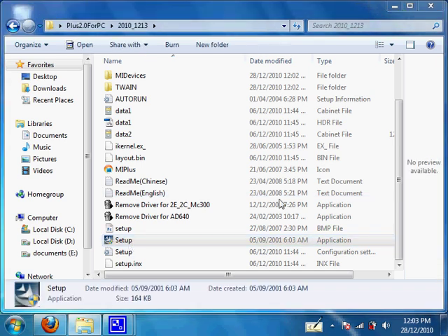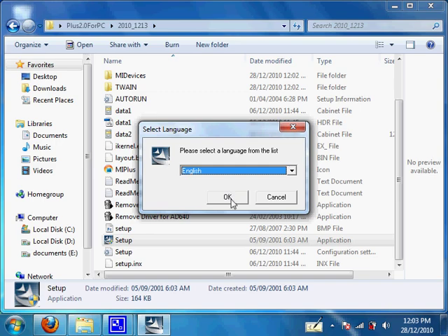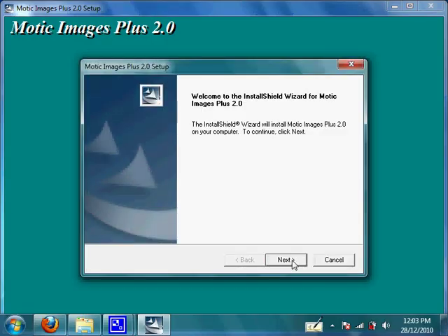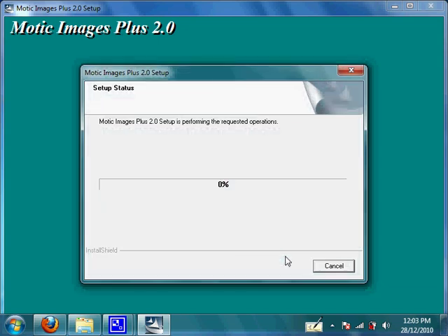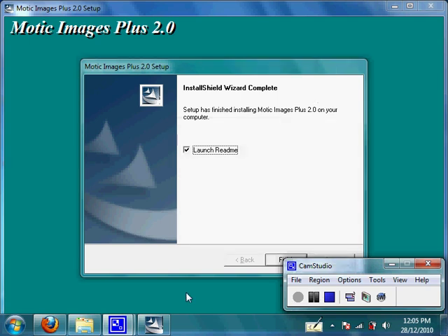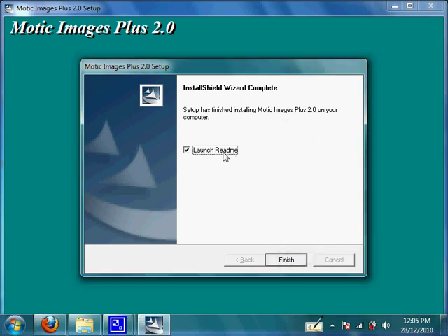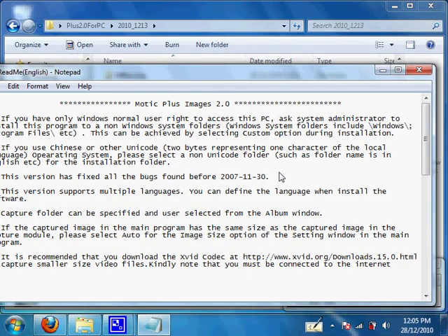Click Yes, then select your language — most likely it will be English — and click Next. I will pause the video for efficiency purposes. Once it's done installing, it will pop up a window saying setup has finished installing Motic Images Plus 2.0 on your computer. Click Finish. It will launch a ReadMe window which you can read over, but we'll skip past it.